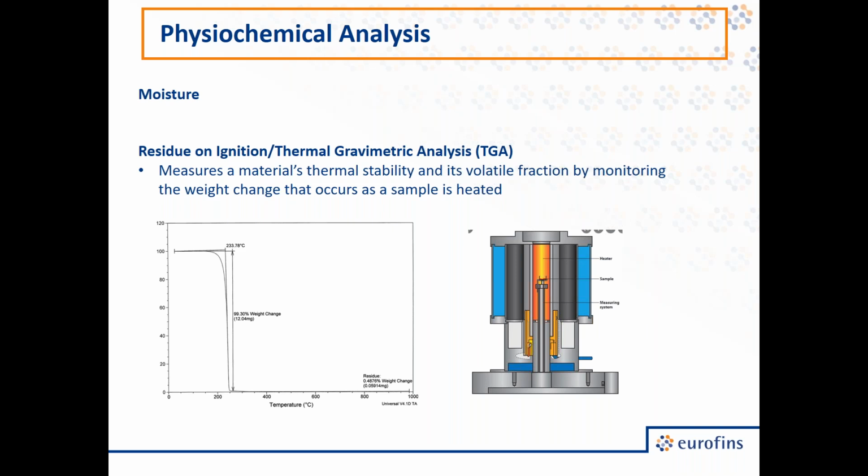Also looking at percent of cure. Many things fail because an adhesive wasn't cured properly, and so it's separated. We can look at the percent of cure using a technique like DSC. For some other techniques, I'll pass on to Val for some more.